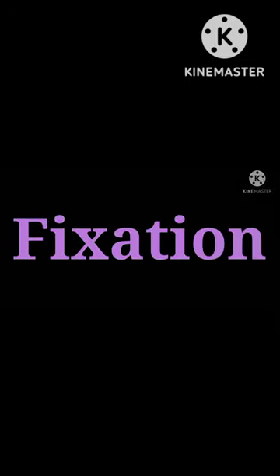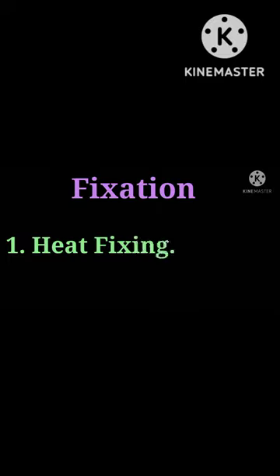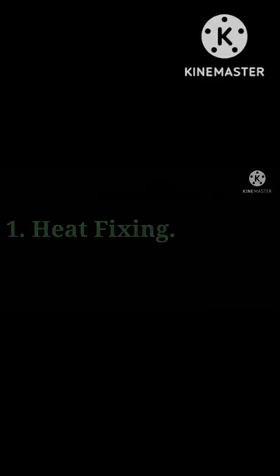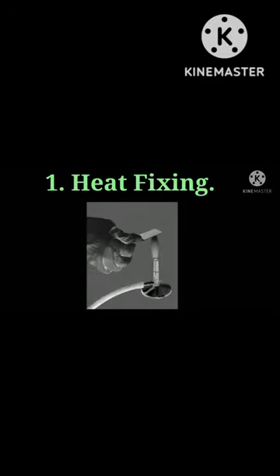Fixation. At first we will see about heat fixing. Fix the dried film by passing it briefly through the Bunsen burner two or three times with the smear side up.